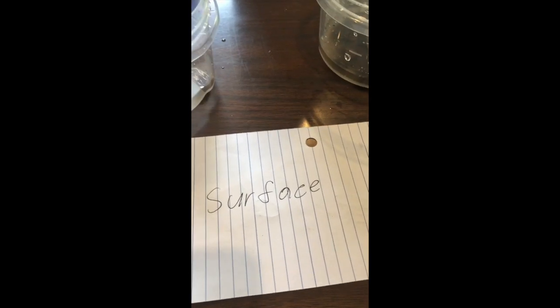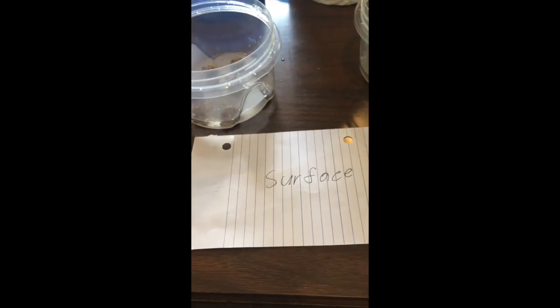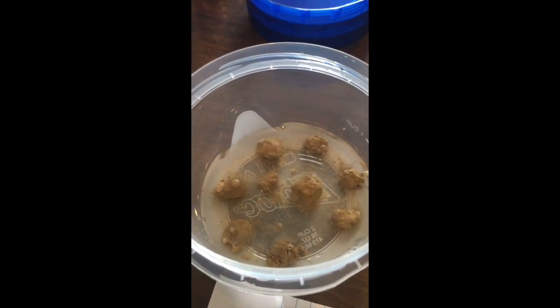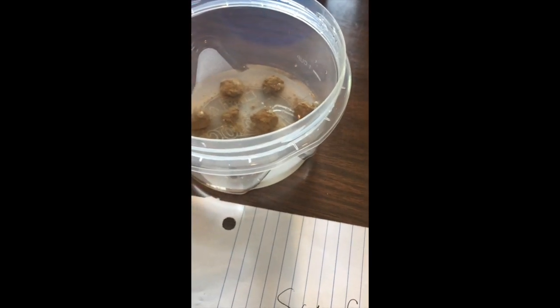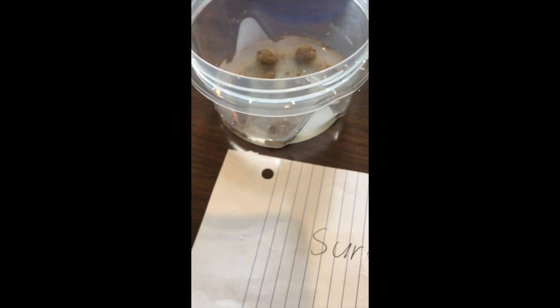So that's 9 aggregates per tub I'm using over here. And I was told to place them in shallow water and watch them closely and just note if they float or sink on the surface and how they break up, or slake. And then in the next 2 hours, I will record whether slaking was complete, partial, or absent.